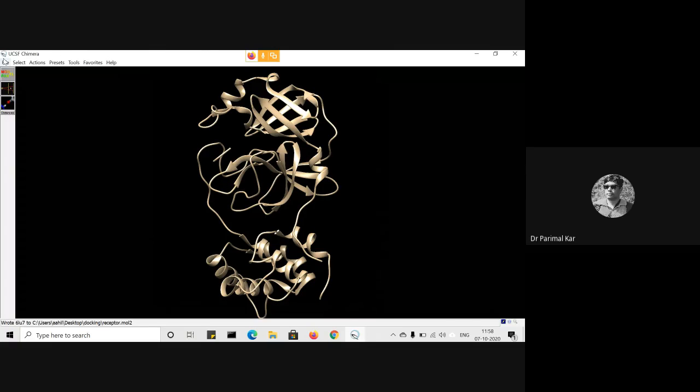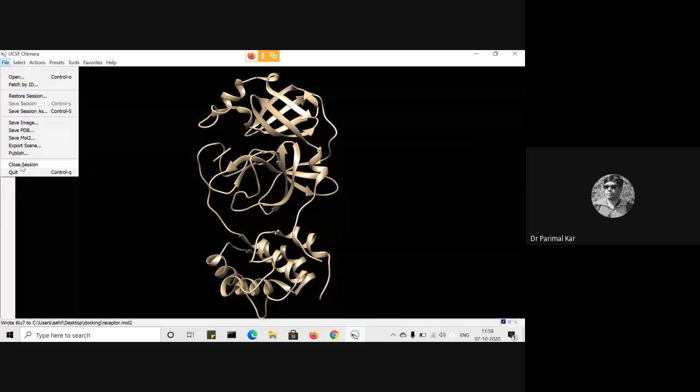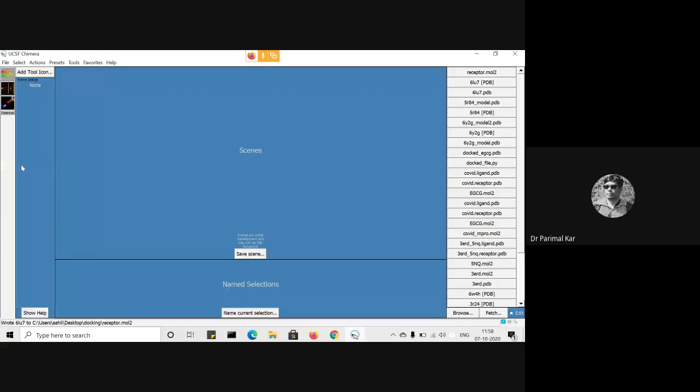So close this session. Next we go for the ligand. Okay, so just go to file.